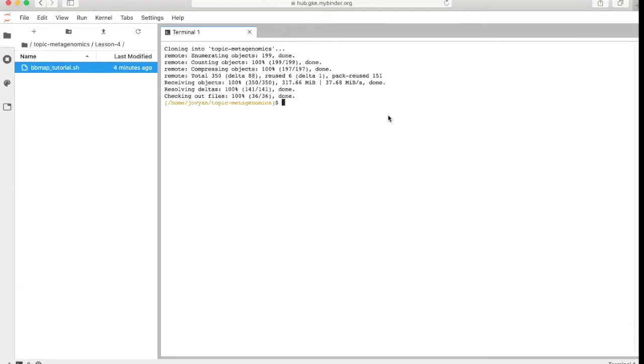One of the advantages of BBMap is it can handle really large indels, so it should be suitable for working on eukaryotic genomes that have large spliced areas. So you could have a part of your read on one exon and the other part on another exon, and it should still map properly to the gene.